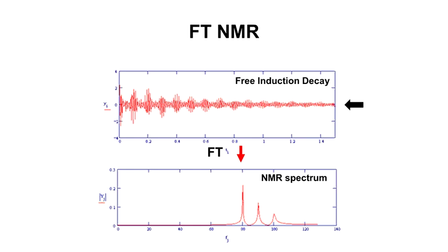This isn't. In the old days, we did continuous wave analysis, and we would scan through the frequencies by changing the magnetic field and measure where we could get these absorbance frequencies. That would take a long time. Fourier transformation allows you to do it in seconds. So it sped up NMR tremendously and allowed people to get tremendous signal-to-noise improvements. So improved magnets, along with improved electronics and computers, made NMR in the 1960s really feasible and essentially the darling of the chemistry community.